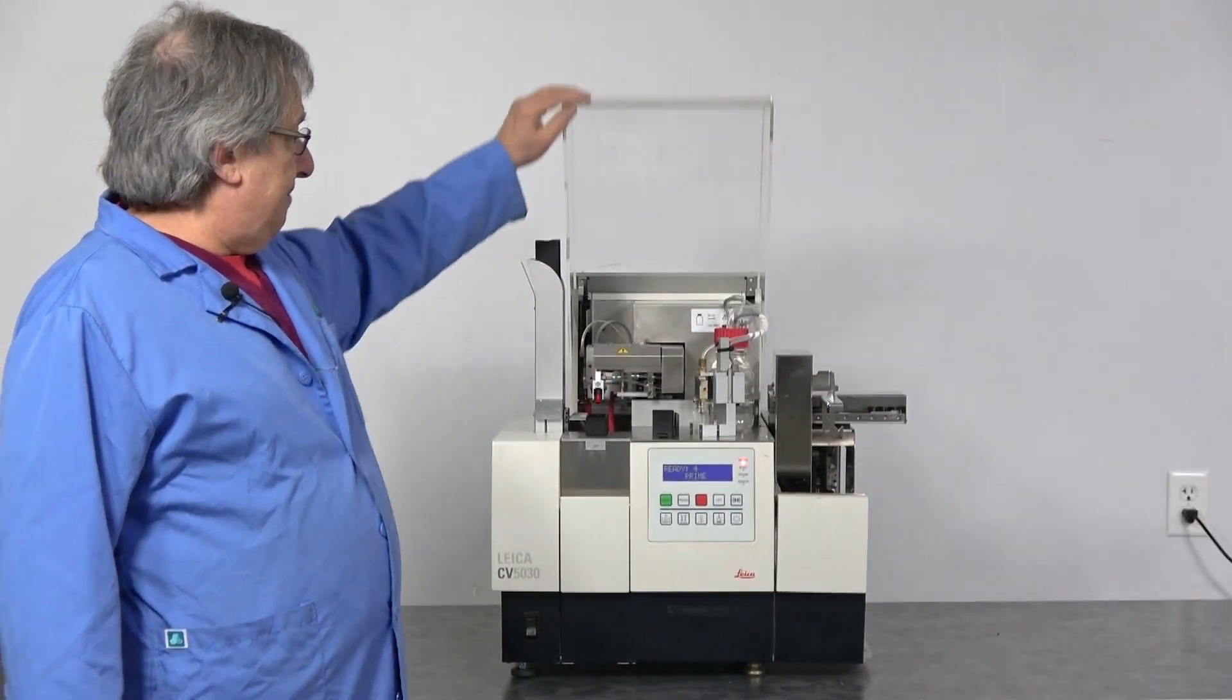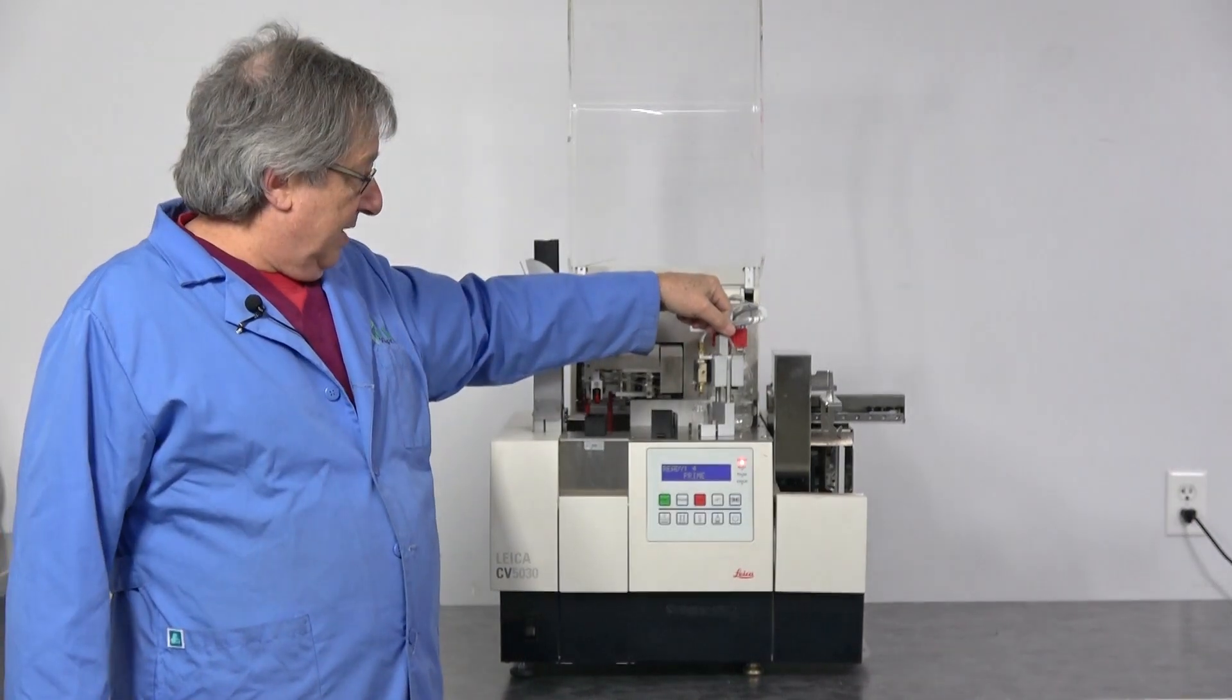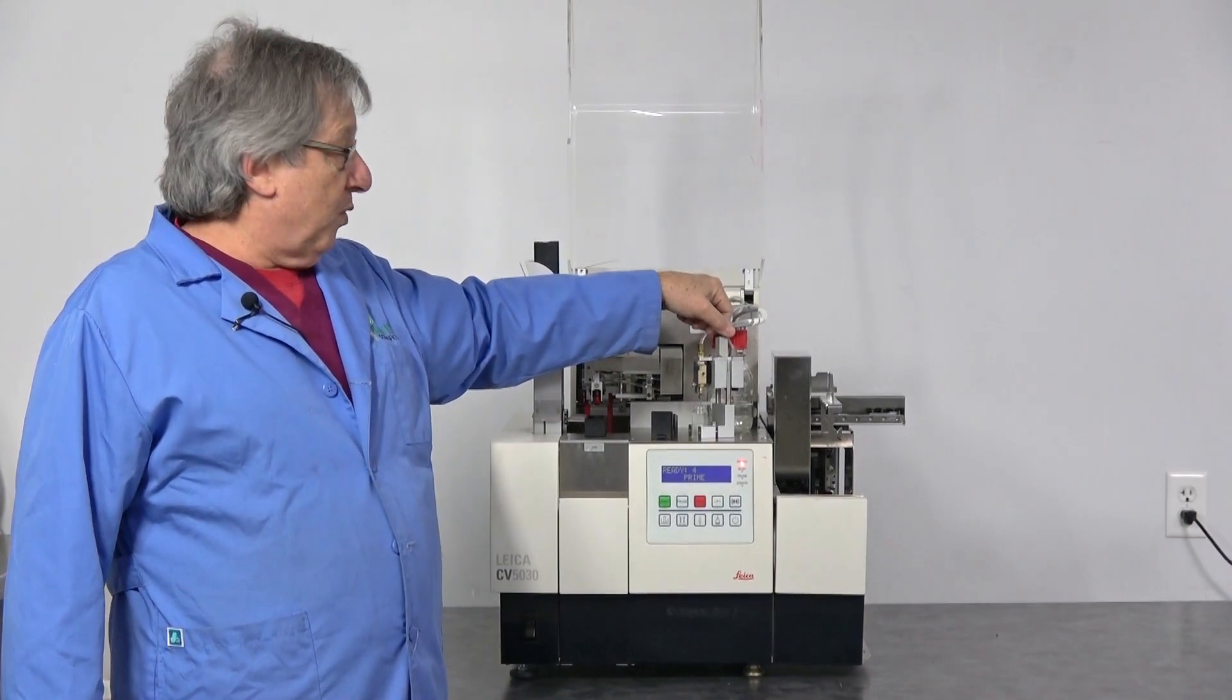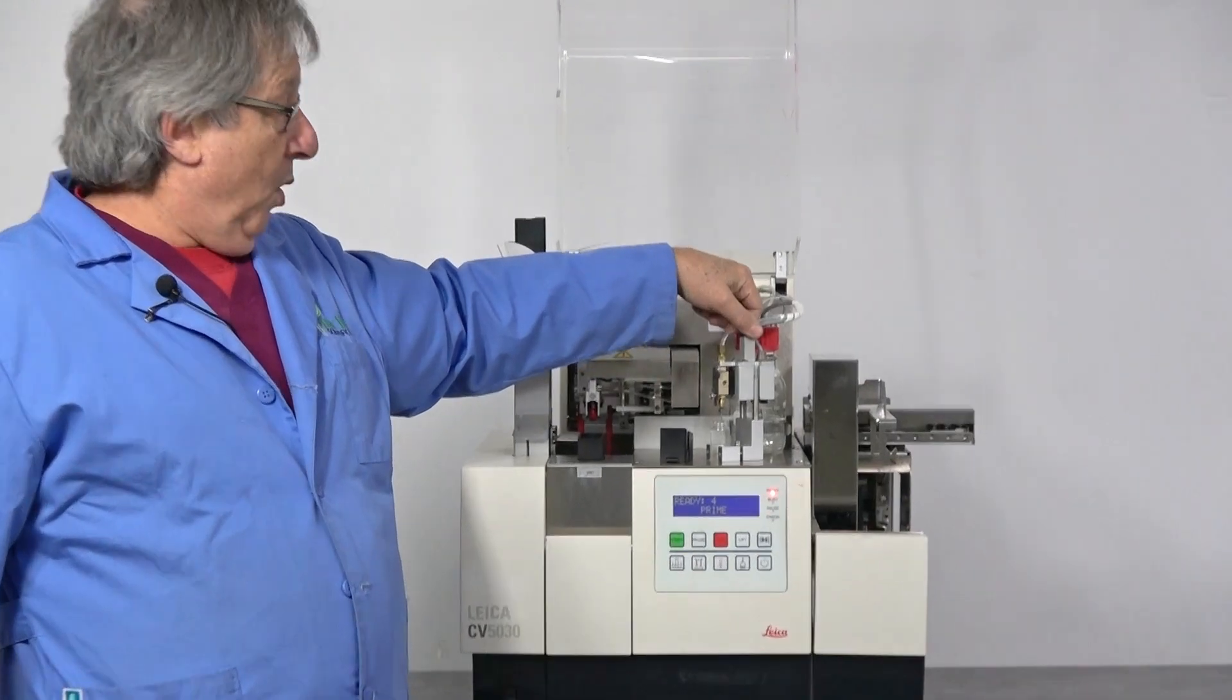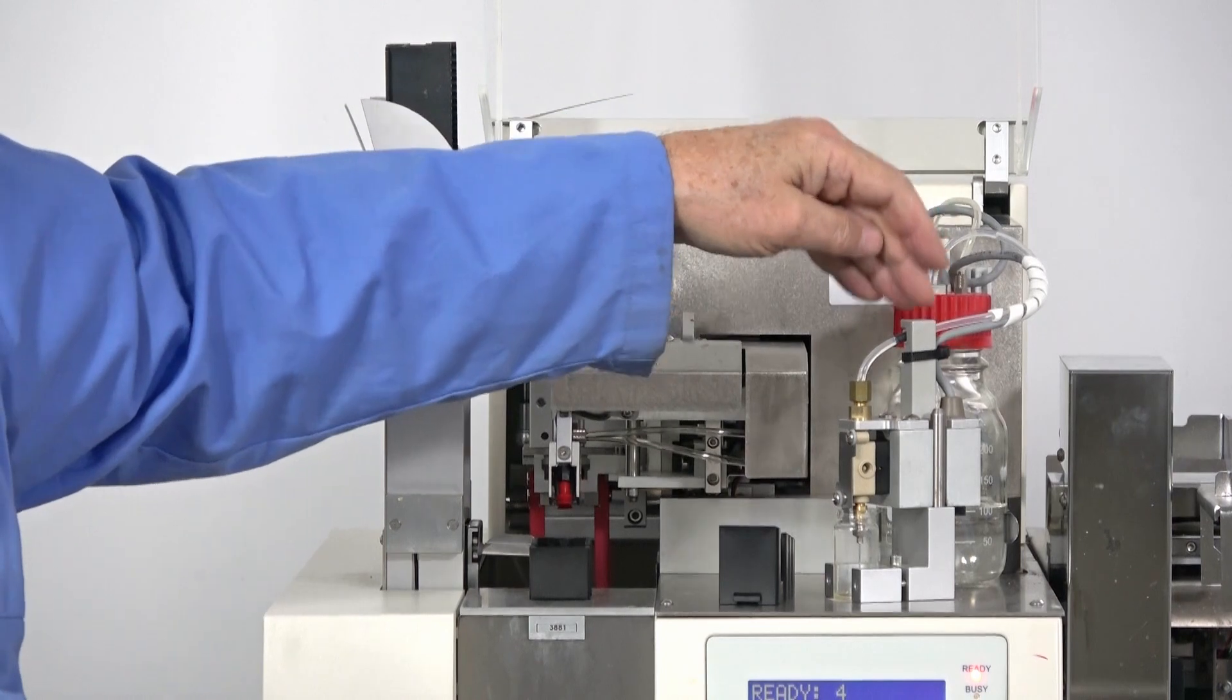Big problem is it doesn't have the dispenser nozzle. You'll see in the running part of this video why that's a big deal. So look for that.